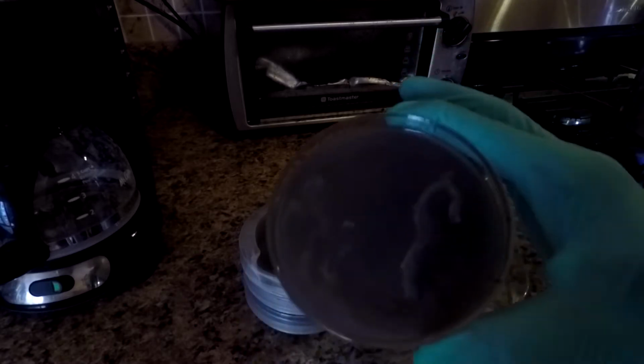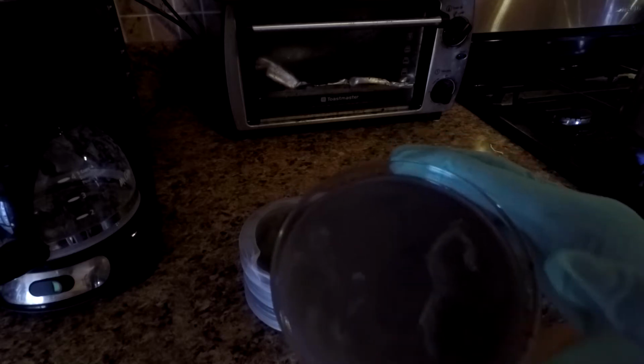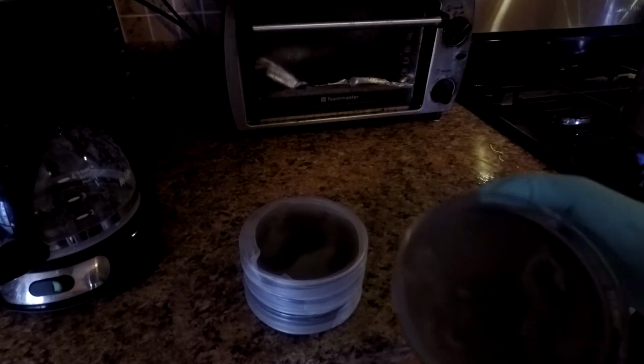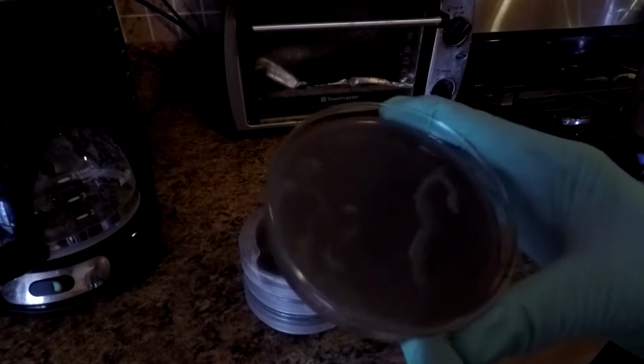I don't see any satellite colonies, which are small little dots of contamination of bacteria or mold, on the agar itself, which shows me that the problem wasn't because of anything in my lab room or anything up with the agar, and most likely not anything with the activated carbon. So that's a bit of a bummer, but a learning experience.